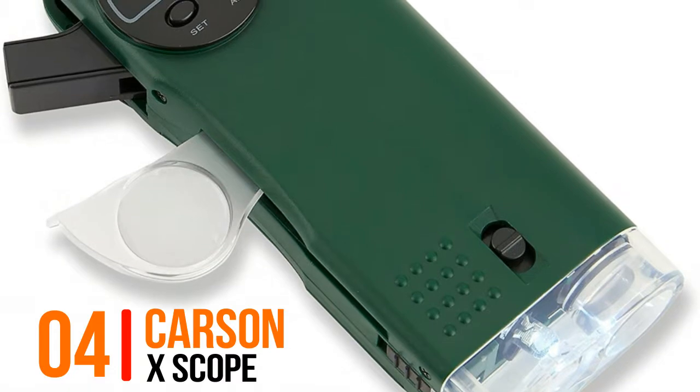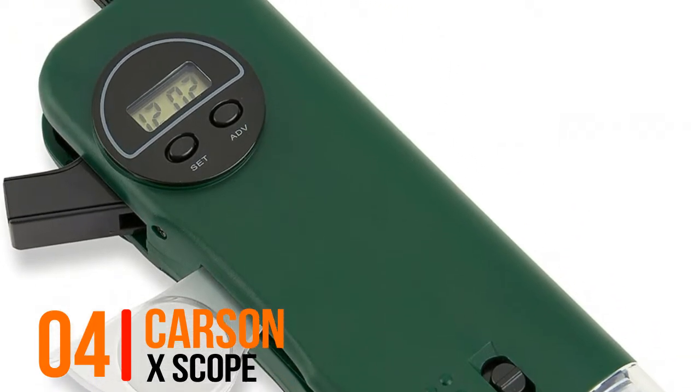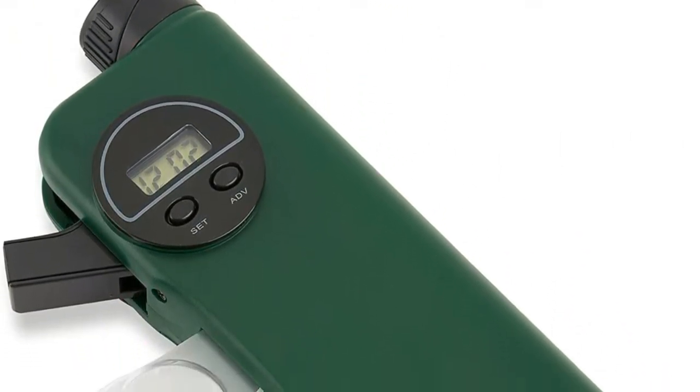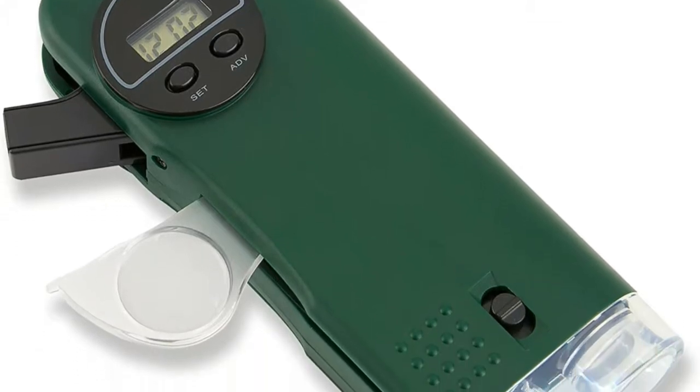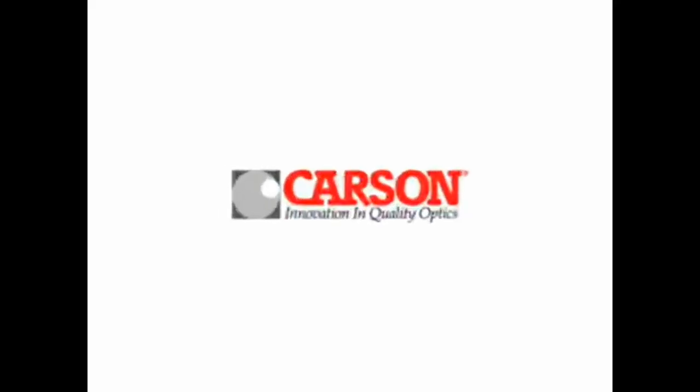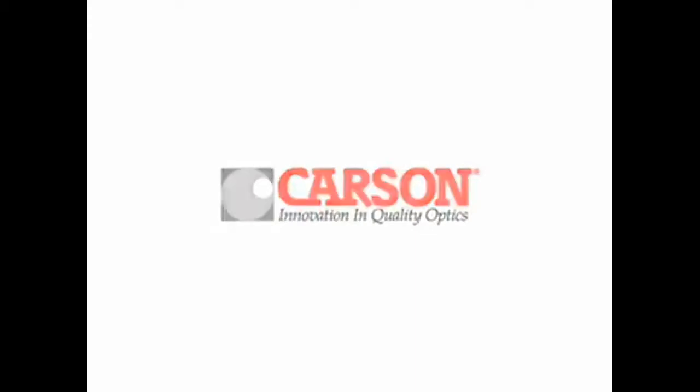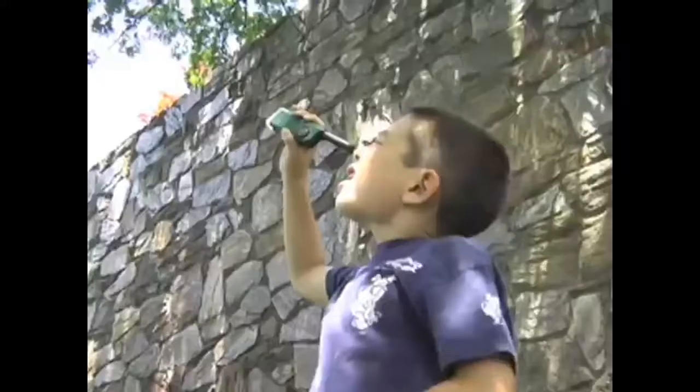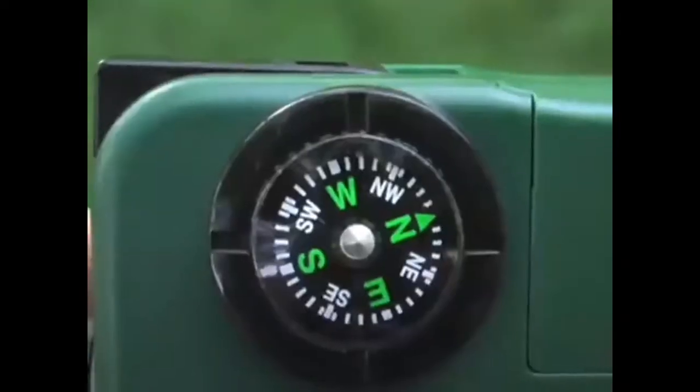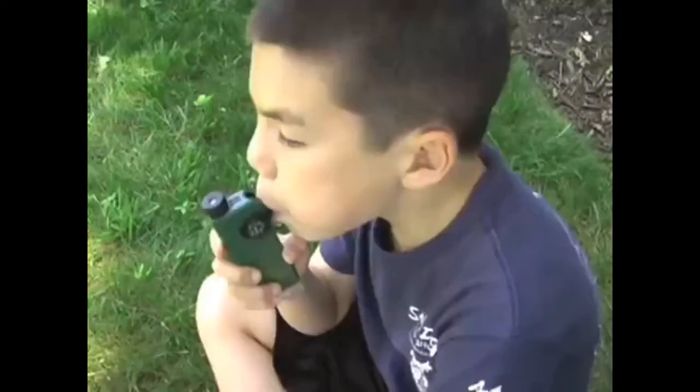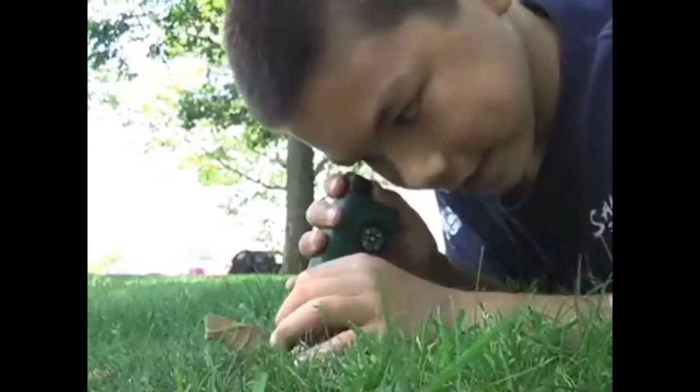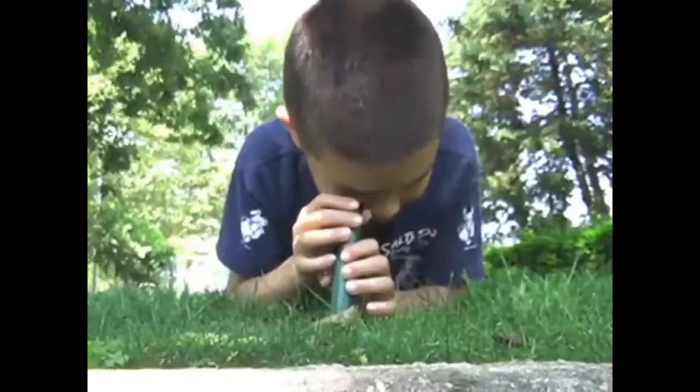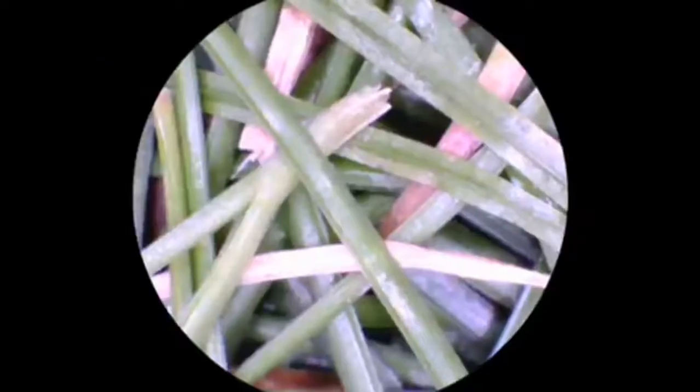Number 4, Carson X scope. If you want to get your kids outside then have we got the toy for you. Introducing Carson's X scope. This toy features seven different awesome features that are great for any child's entertainment. First, it's a 30 power microscope with a focusing ring so your kids can view even the smallest details.